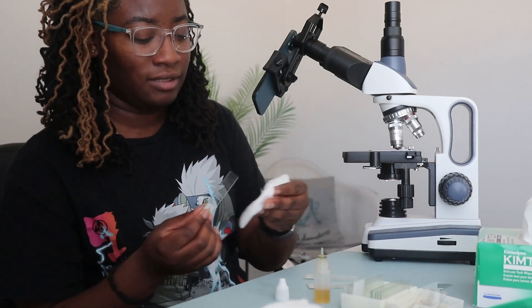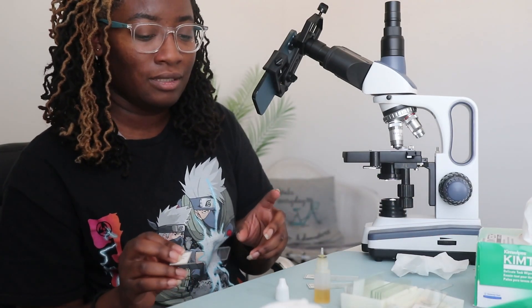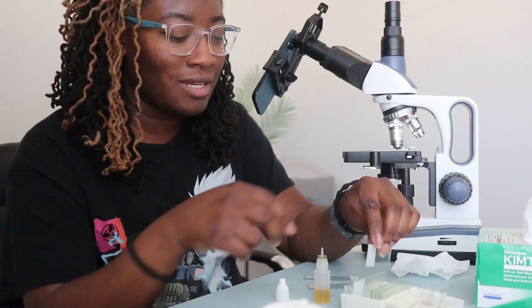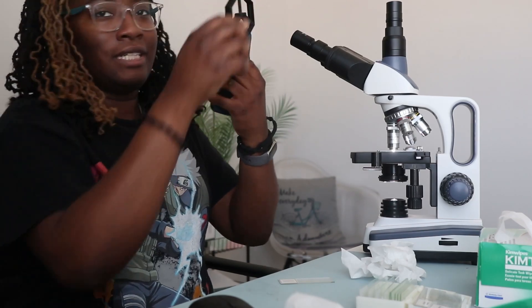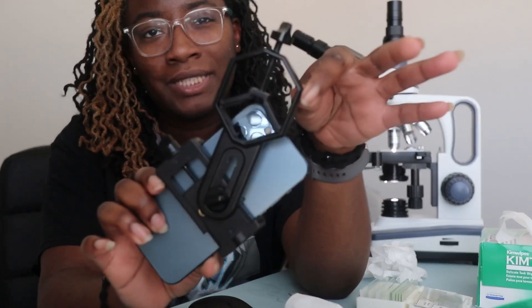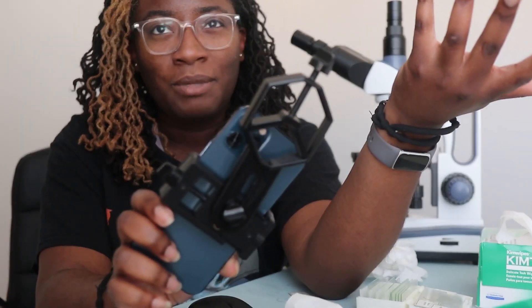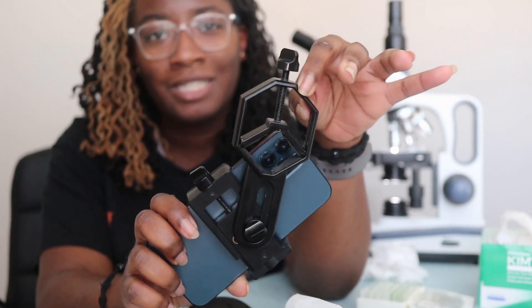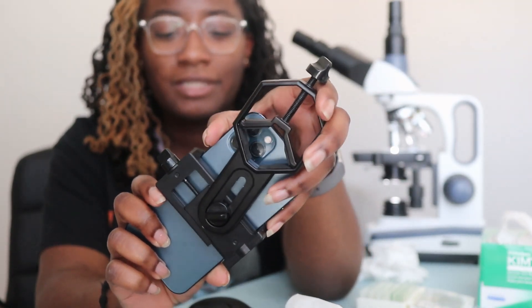One thing that this scope does not have is a stopper — some scopes have a stopper so that when you're moving the coarse adjustment knob too far it stops so that you don't break your slides. This one does not have that. If you're wondering about the phone holder, this was like $17 on Amazon — I just searched 'microscope holder,' but I think it's made more for telescopes. You could just use it for a microscope too. I'm glad it worked.